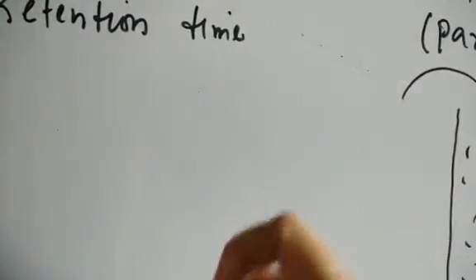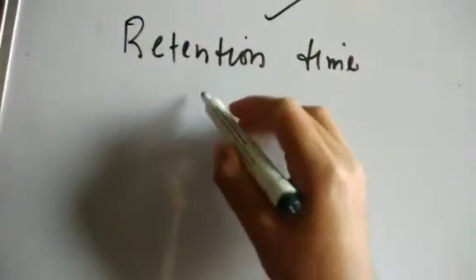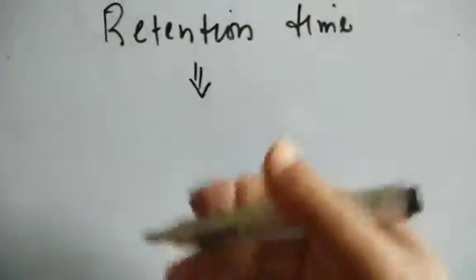It can be taken from the injection time to the elution time. Now this retention time depends on many factors.